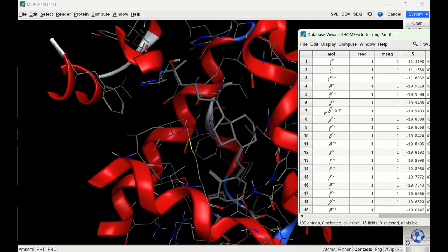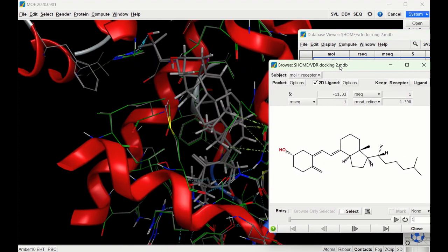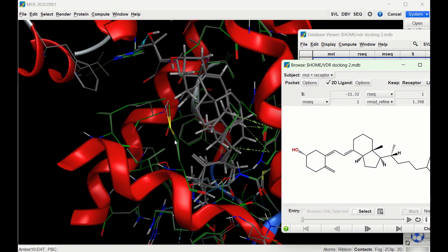Now that the induced fit run is done, let's look at the database. The docking scores are already a little higher than with the rigid receptor — for ligand one, the highest was negative 10.6 before, and now we have a negative 11.3. Going to File and Browse, we immediately see a difference: some of the protein is highlighted in green, showing how the receptor has moved to conform in the induced fit model, while gray indicates the original receptor position.